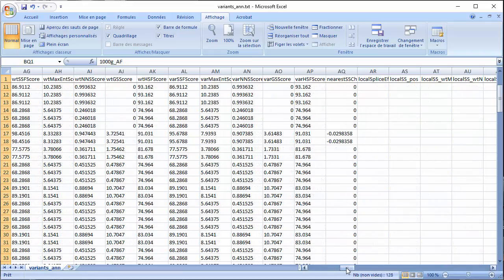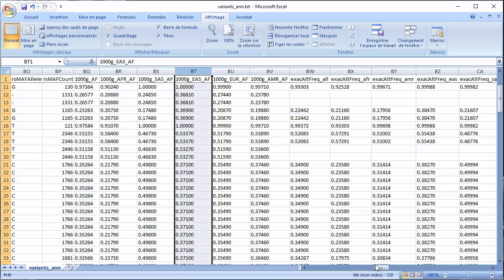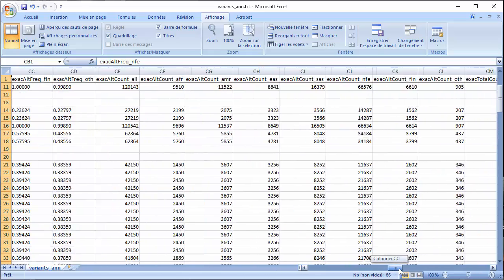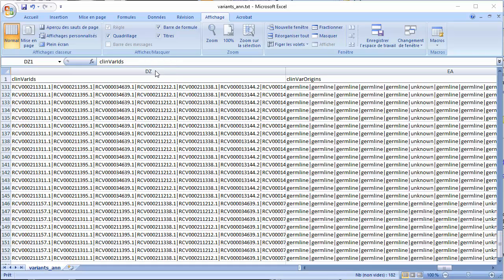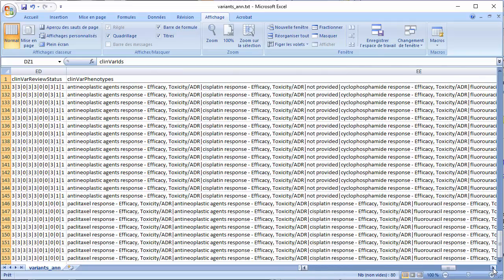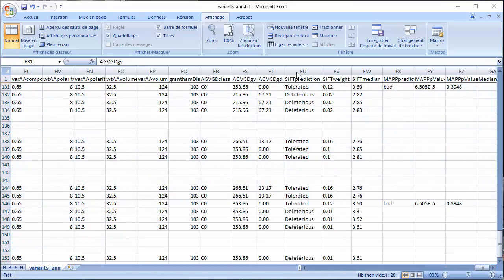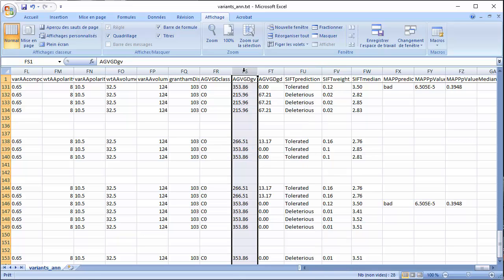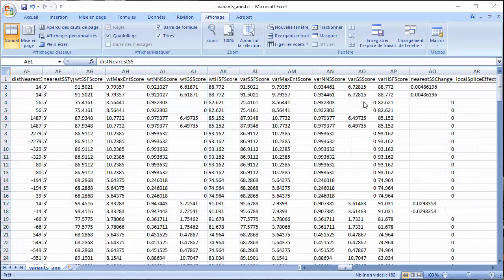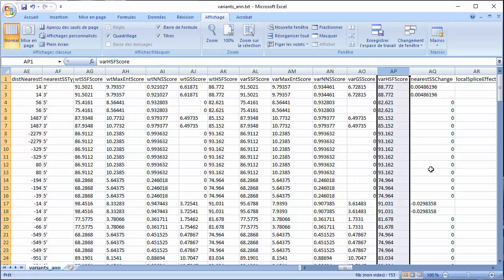Annotations include, for example, allele frequencies from different public databases such as 1000 Genomes and ExAC, ClinVar, HGMD and COSMIC, and splicing predictions from different tools such as MaxEntScan or HSF. All annotations are documented in the user manual.